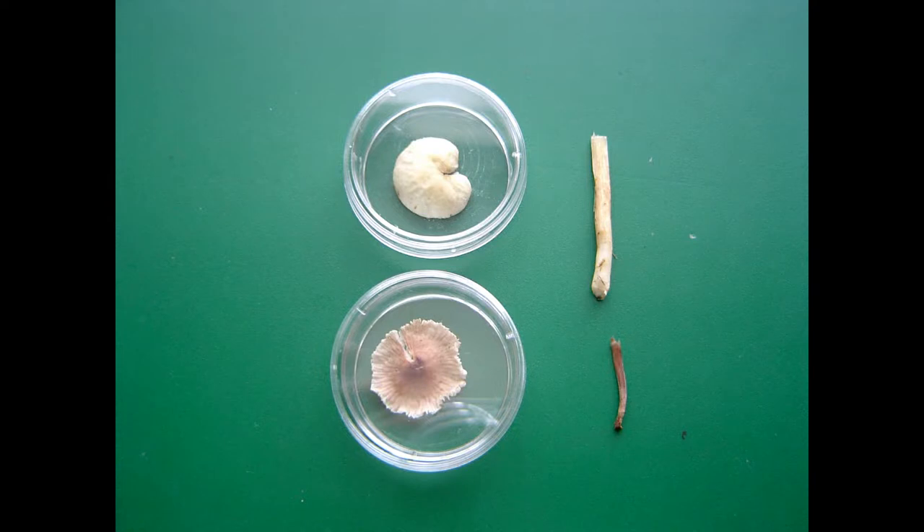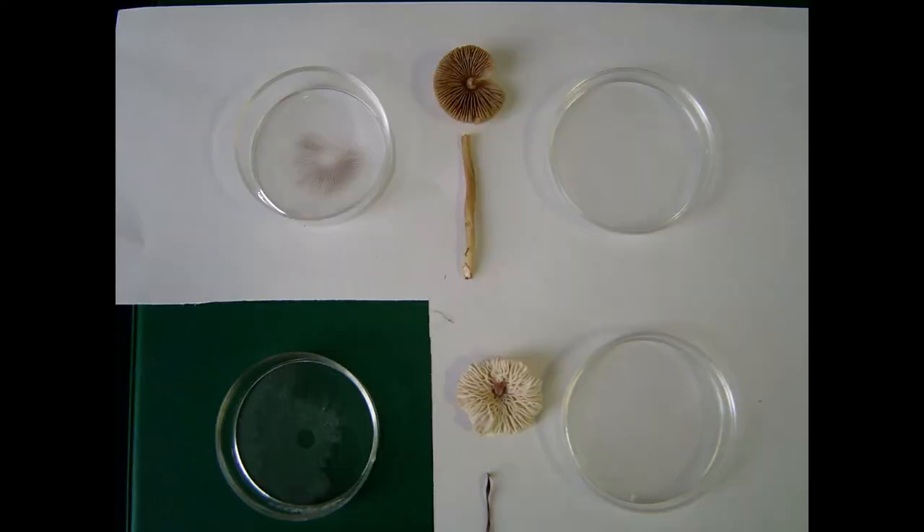Another technique is to do it on petri dishes instead of paper. So you use empty petri dishes, place the pileus in there, and wait for the spore print to happen. A good thing about this is that, first, you can see the colors, and another thing is that you can contain those spores in a better controlled environment, so you can use these spores for culturing or to transfer them to grow mushrooms.